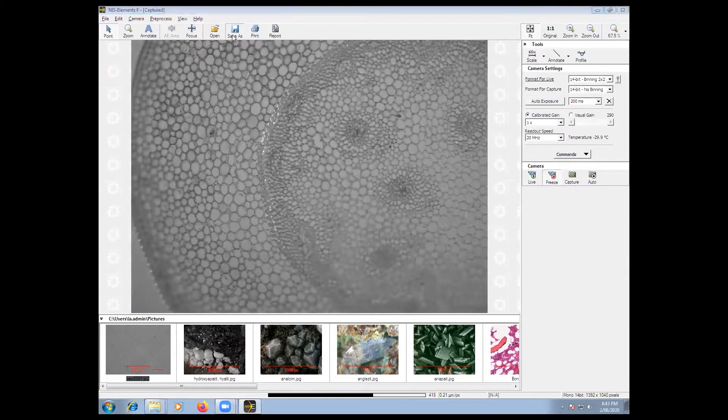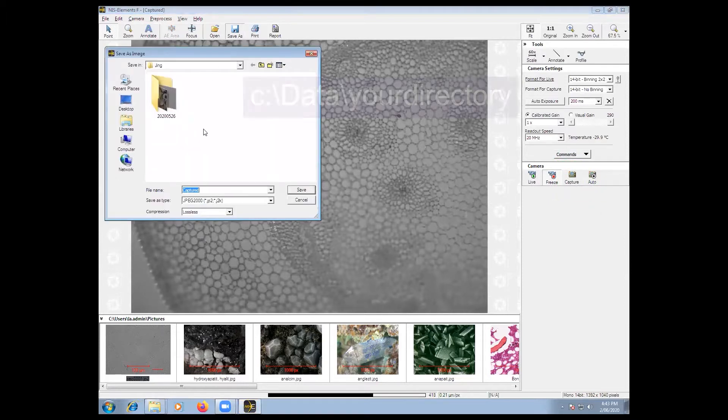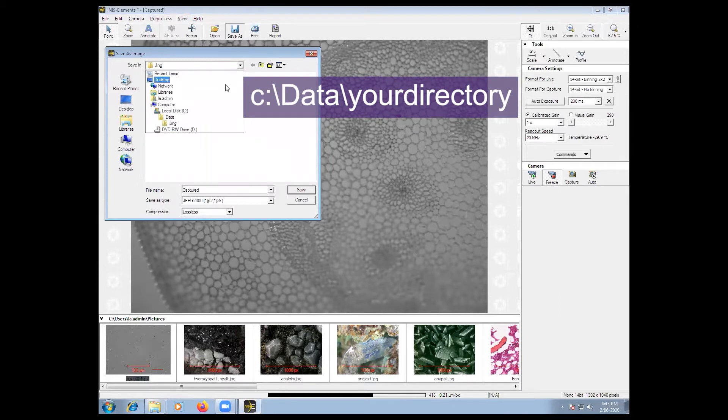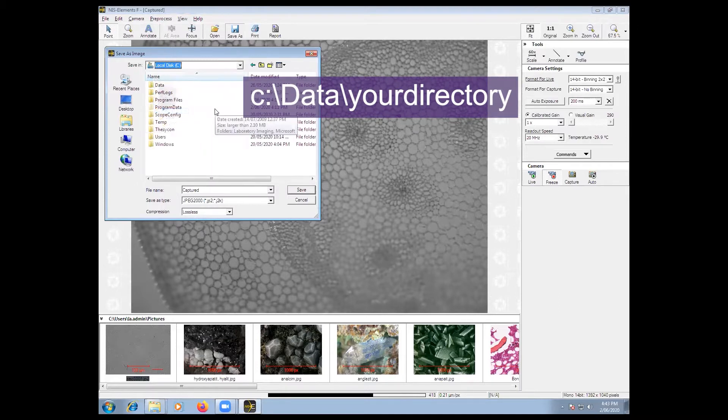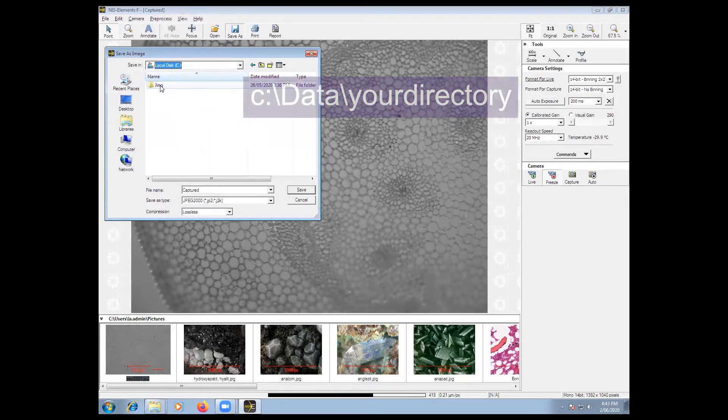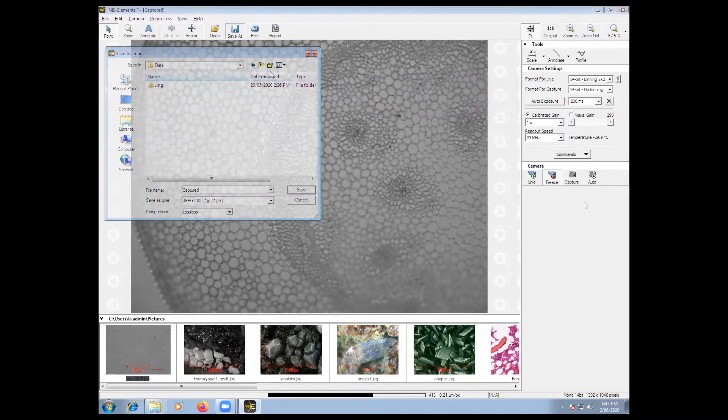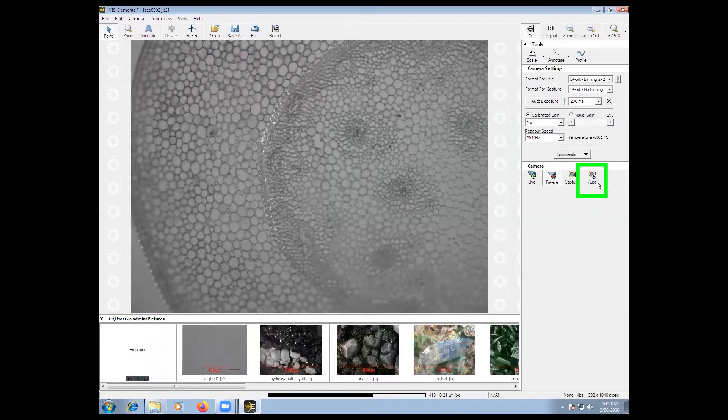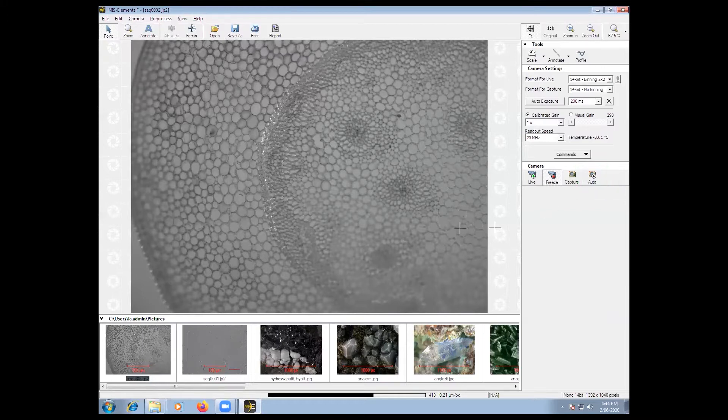Capture an image and save your data to see data. AutoCapture automatically saves the captured image to the directory you have chosen before you started collecting your images.